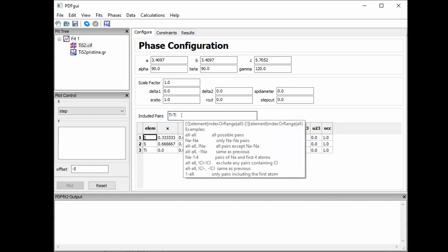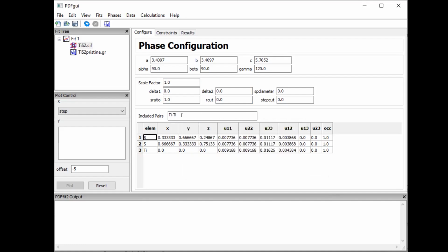And this function can be very useful if we are particularly interested in some specific atomic pairs. If time allows, we will show how to use this function, especially for neutron PDF data. And we'll discuss why we use neutrons and why neutrons can be so effective in characterizing the oxygen-related structures. So at this stage, we'll stick to all. Okay. And this is basically the structural parameters.